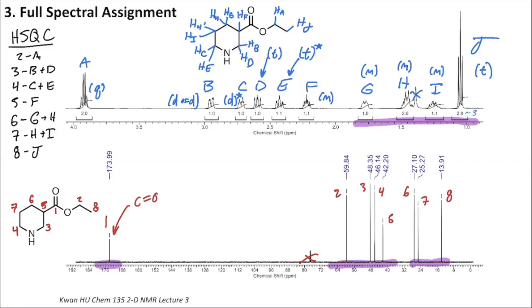Okay, so hey, we're pretty much there. The last thing to do if this were your post-lab assignment would be to get all of your assignments on the same structure and fill out the data table. We don't have a data table for this one, but you could practice filling one out if you like. The one last thing I do want to leave you with is for this example and one part of your post lab, you have a lot of these grouped CH2s, right?